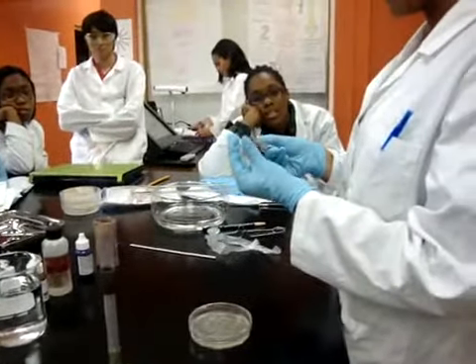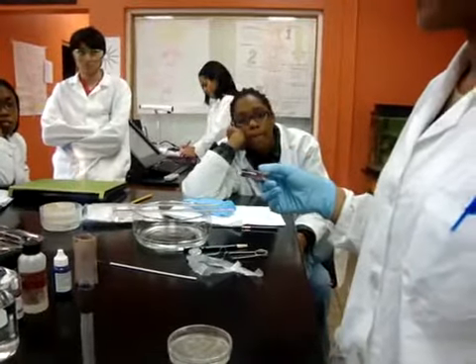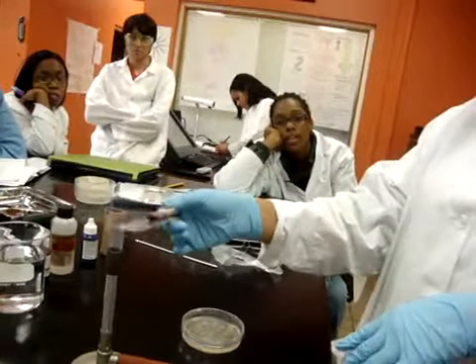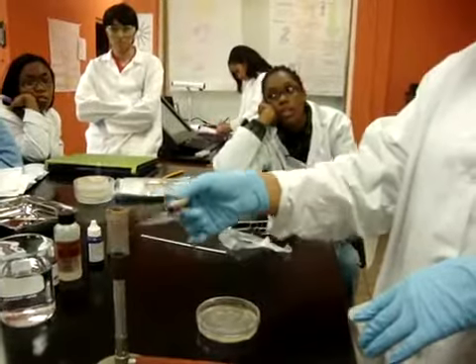Now once you have your bacteria smeared in your water, you're going to use your slide. To fix the bacteria to the smear, you pass it through your flame lightly, just like that, until all the water has evaporated. So if you put it on a slant, you can see a reflection. And when all the water has evaporated, you shouldn't see that reflection anymore.